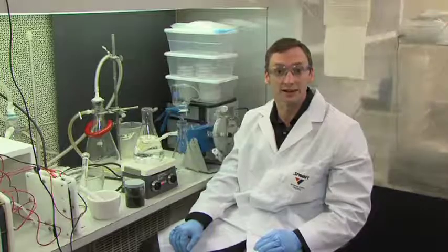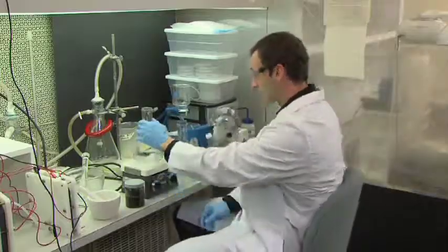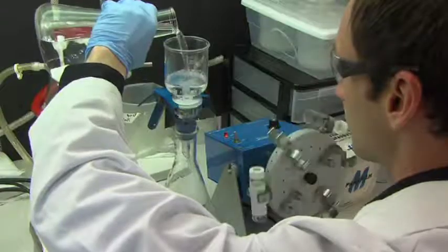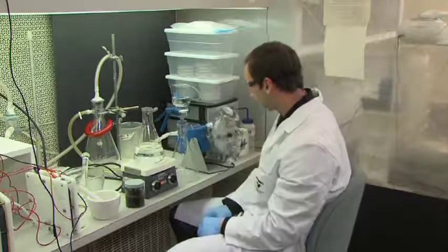Step 4 is the final separation of the extractions from the remaining solid. In this step, the liquid extract is separated from the solid phase by filtration. If the initial liquid phase of the waste is compatible with this extract, the two are combined and analyzed together. If they are incompatible, each is analyzed separately and the results are mathematically combined.